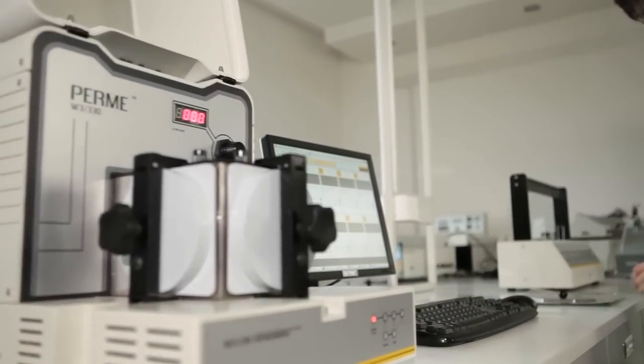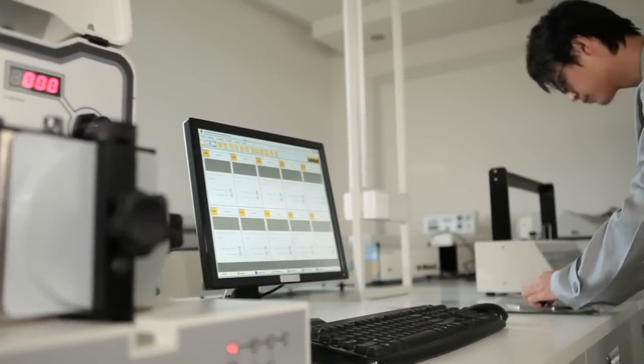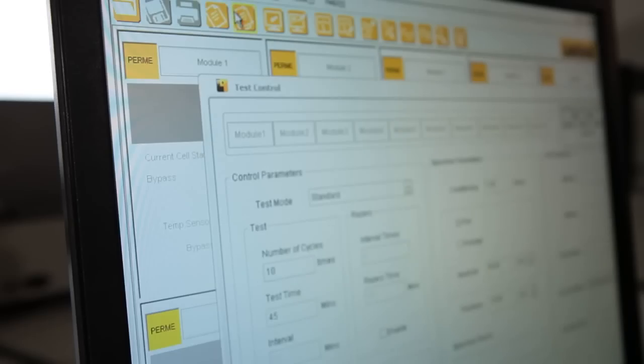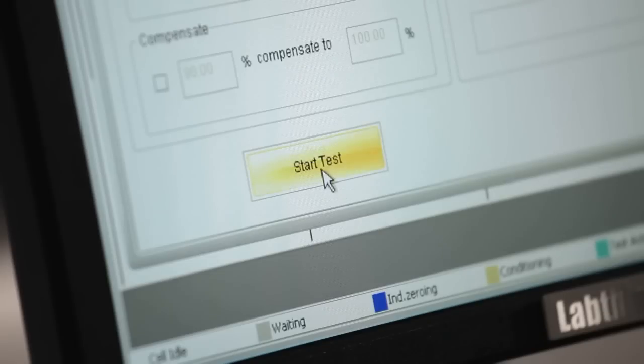Operating the instrument is simple and convenient. Users only need to place the prepared specimen into the test cell, complete the parameter setting and click on Start Test.